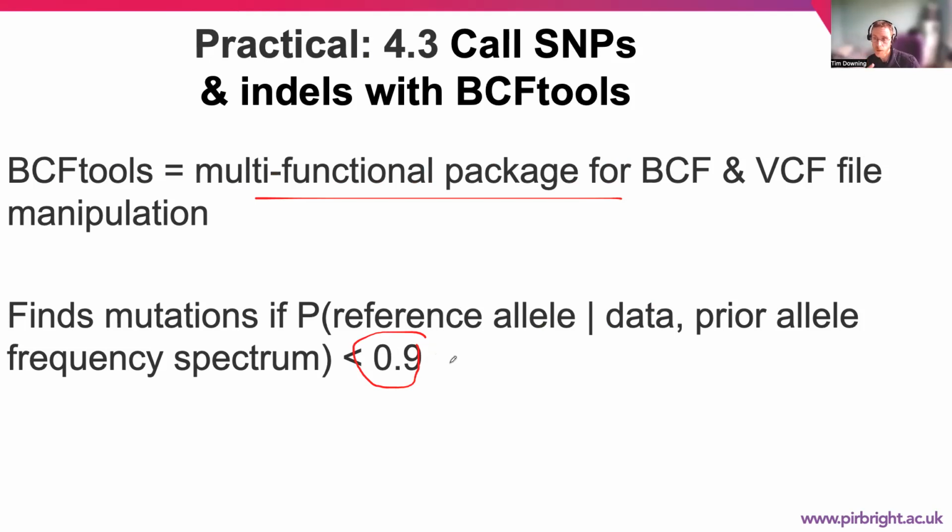It's not absolute, but it might be indicative that it's a mutation. So bear in mind that it runs particular statistical tests to screen out mutations that might be erroneous because they contain many forward or reverse reads and not the other type, because that could be associated with PCR artifacts.